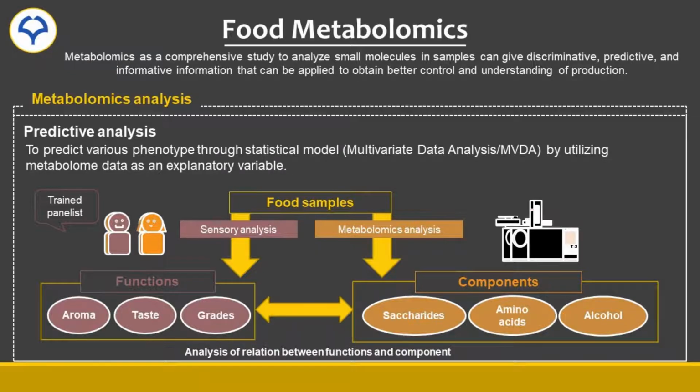Food metabolomics in Fukusaki Laboratory focuses on analyzing small molecules such as amino acids, sugars, organic acids, and many more to understand about the food production and processes. Such analysis can give discriminative, predictive, and informative information to both food industry and consumers.